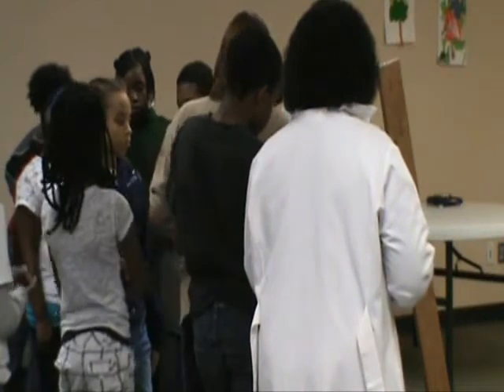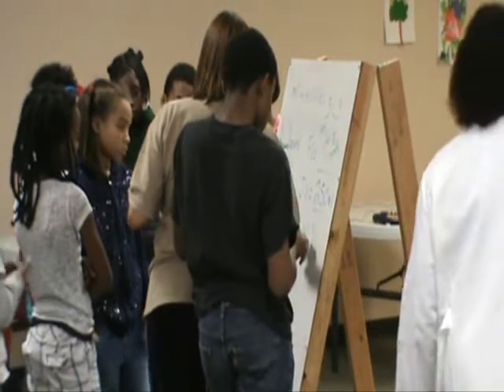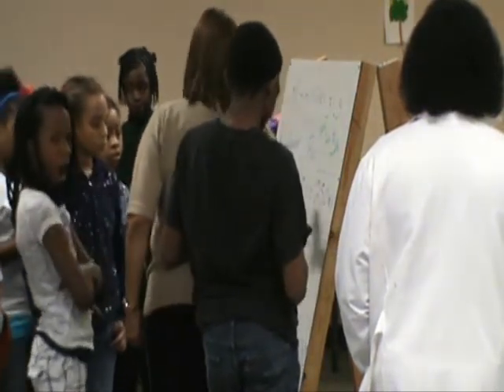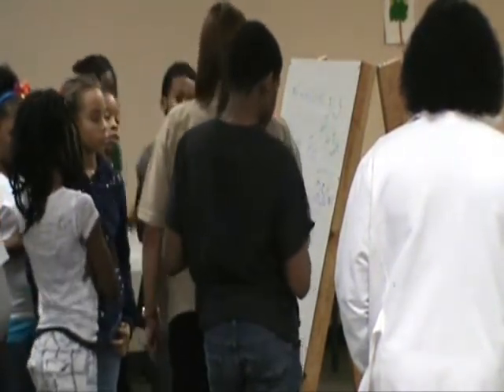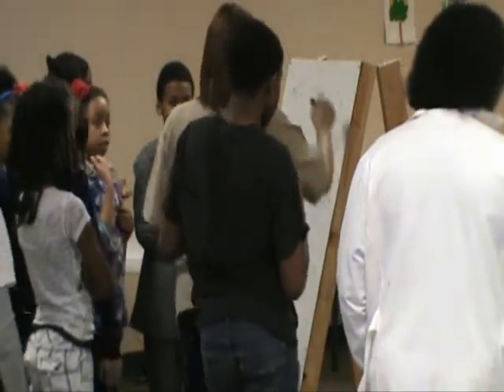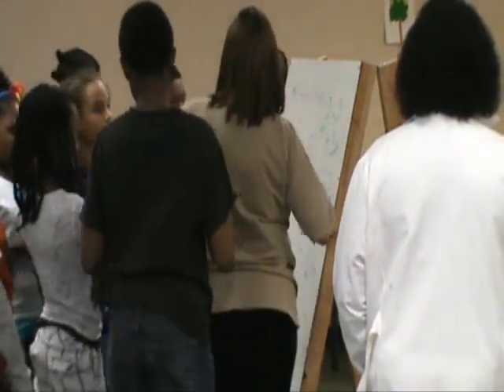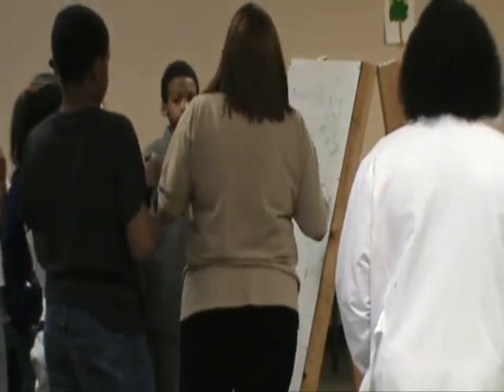Hundredths. Excellent. One thing about a scientist, your math skills become so much better when you understand the laboratory, because these are the measuring devices that make your mathematics strong. So which balance is more accurate? The manual? Actually, they're both very accurate because both of them weigh 31.3. But which one gives us the greatest ability to weigh at the most accurate level?